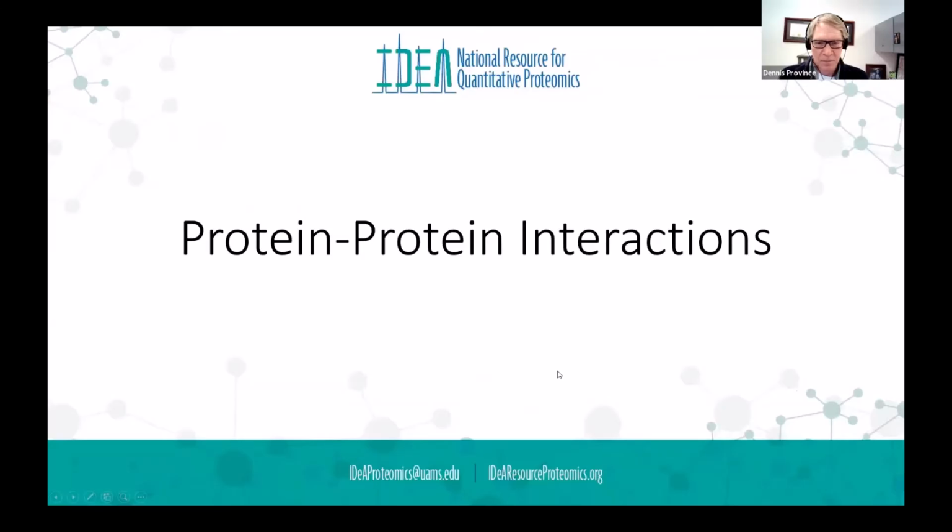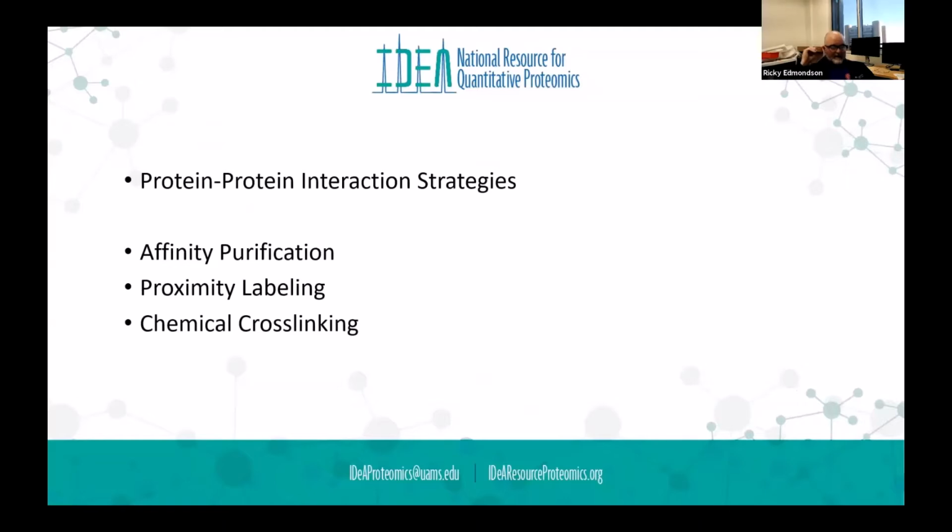All right, so I'm going to talk about three different types of protein interaction strategies. I'm going to talk a little bit about affinity purification, proximity labeling, and chemical cross-linking.